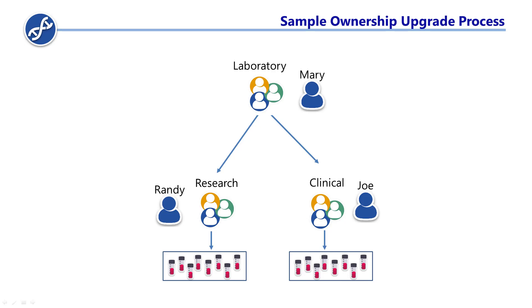Then remove Joe from any other group. That way, Laboratory would have restricted access to the new group's samples, and thus Joe's, but not Randy's.